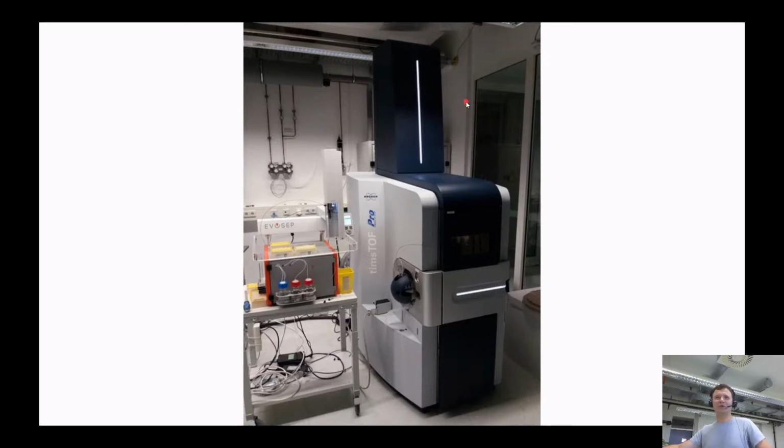And the question is, what's going to happen with all these molecules from the perspective of the instrument? Are we going to still see molecules with 100, 200, 300, or is it going to be higher masses, let's say 101, 201, 301, or is it going to be lower masses? So it's actually an open question. When the teacher asked this question, I mistakenly said that masses will decrease. The reason was that by increasing the temperature, you increase the amount of chaotic movement. As a result, most of the ions will reach the detector faster. But that's mistaken thinking, it's not the correct answer to this question.